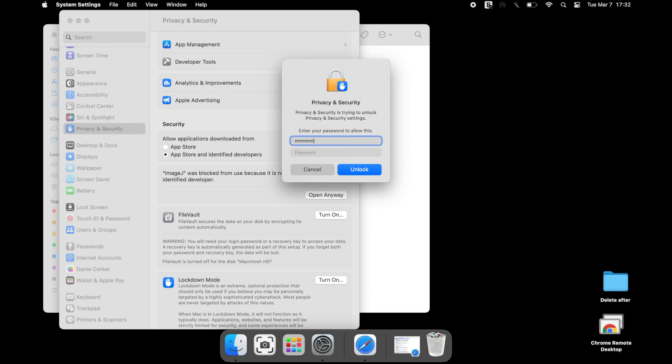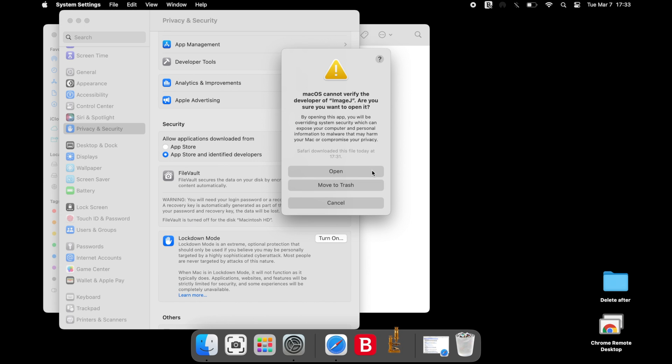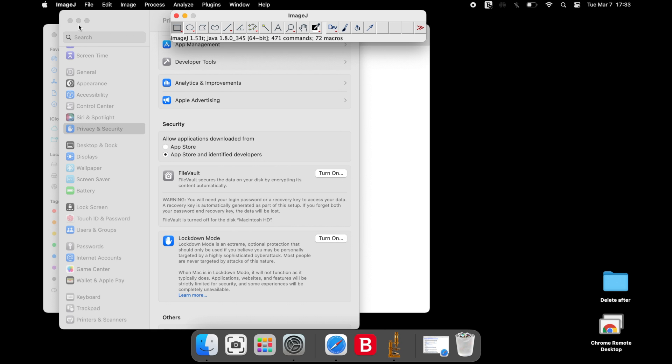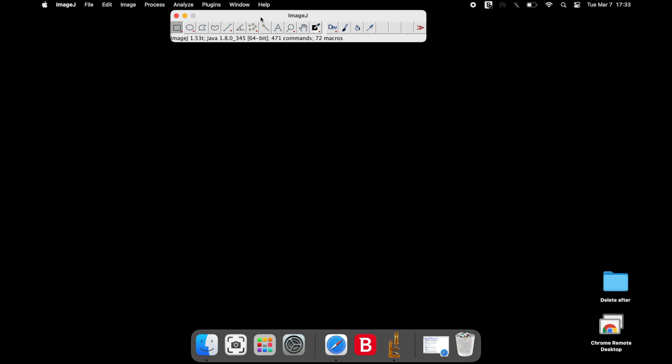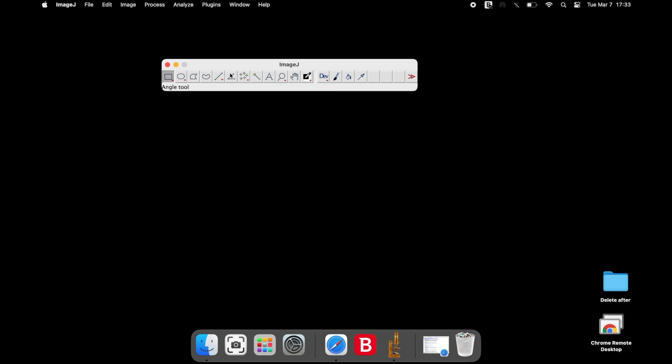Depending on the operating system settings, the next pop-up may ask for your operating system user name and password to unlock the privacy and security settings. A final warning message may pop up again. Select open and the ImageJ software will launch. This software is now ready to use.